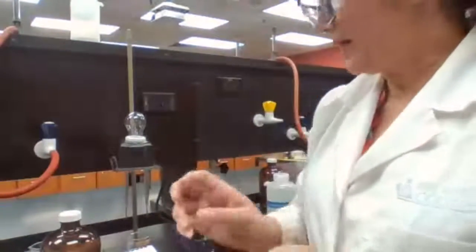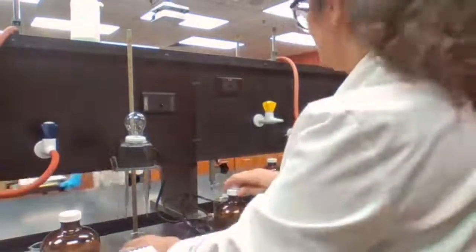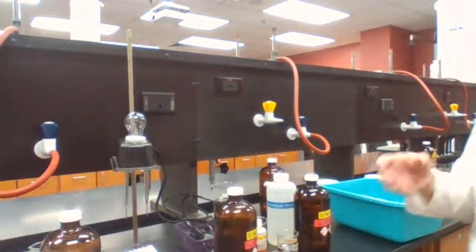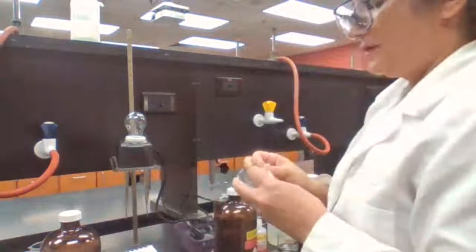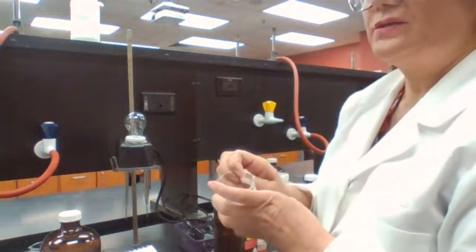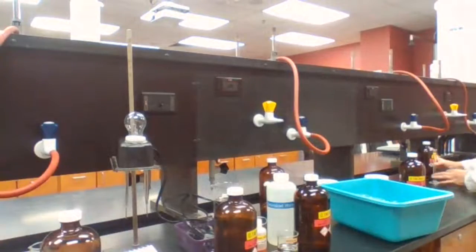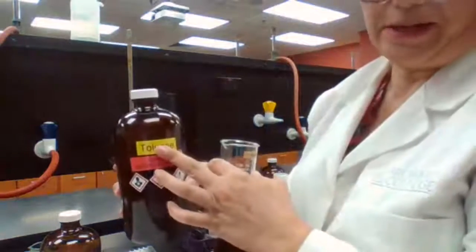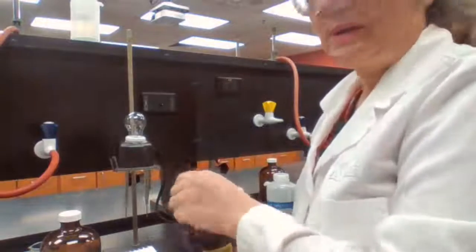Since I told you that water is needed to dissociate the acid, to change to the ions, to see the ions, now if we use glacial acetic acid and we don't add water, instead of water we add toluene. Toluene is an organic compound. It has only carbon and hydrogen. It's a molecular compound.